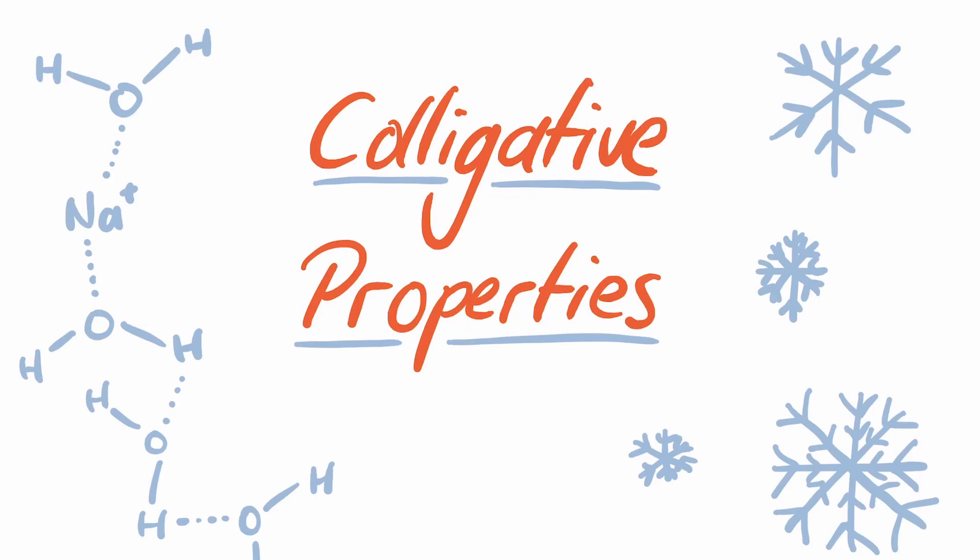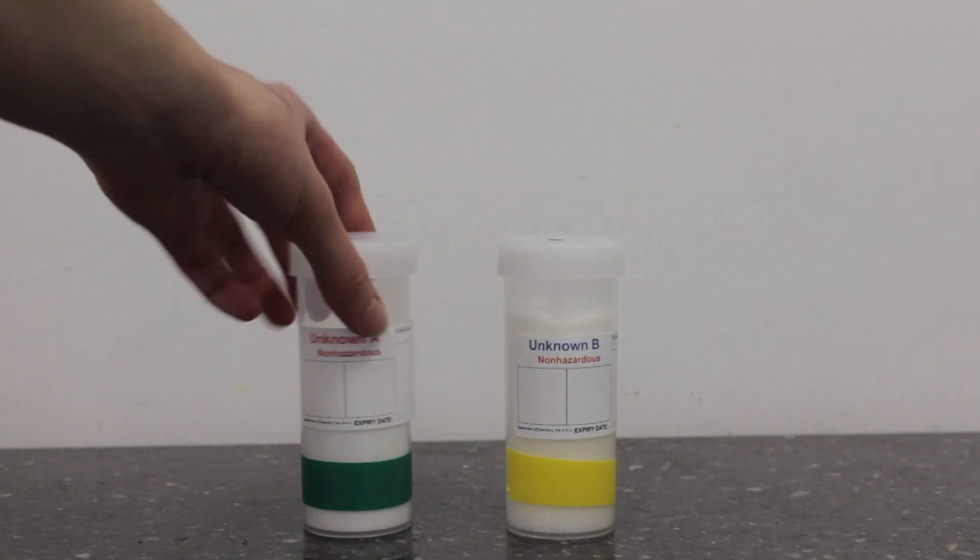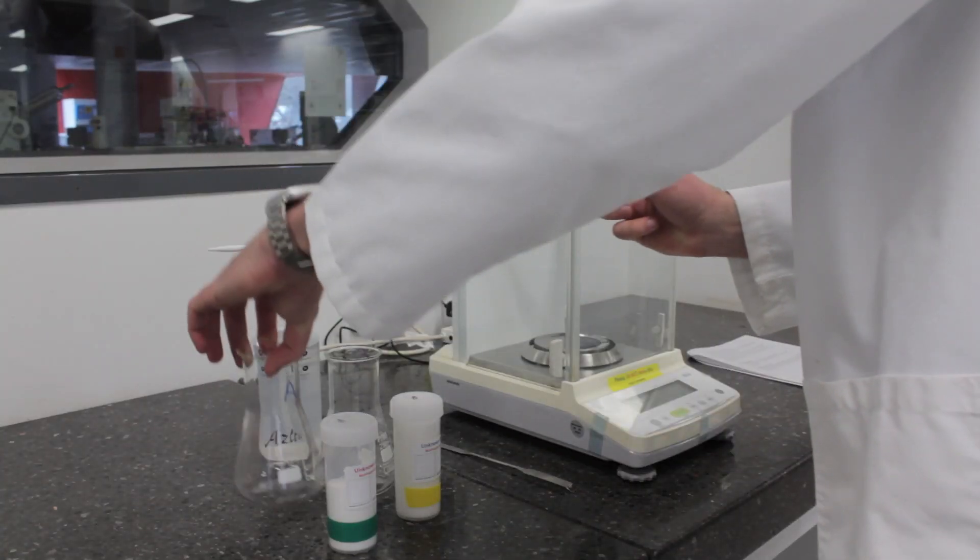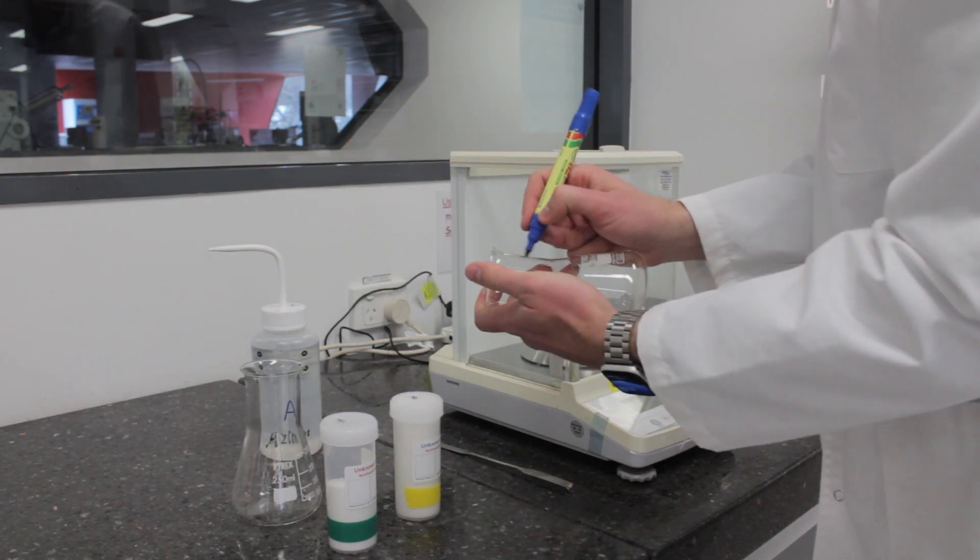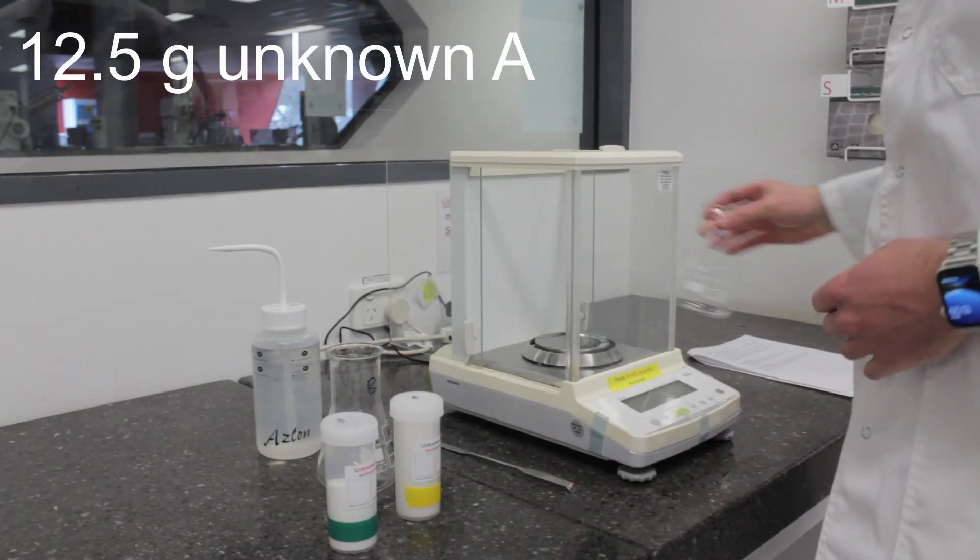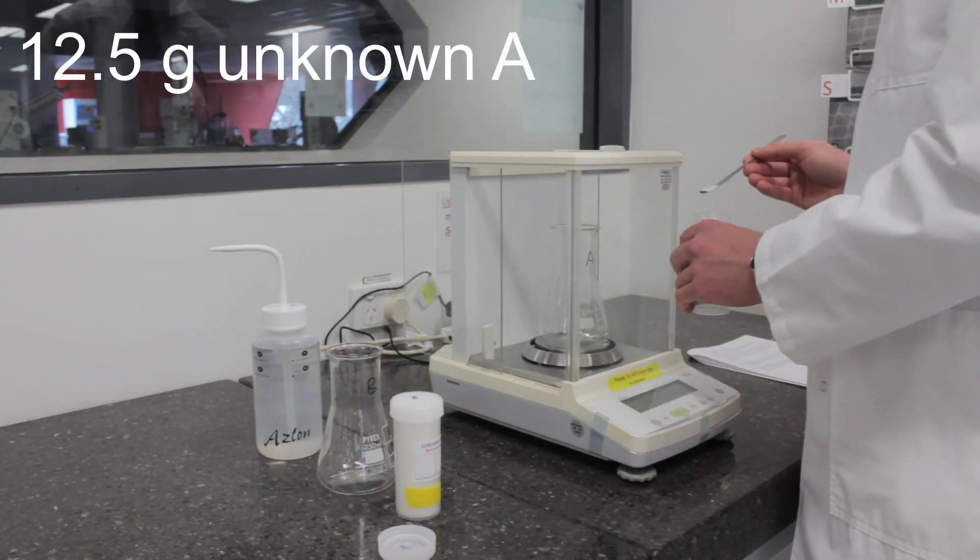These unknowns take a while to dissolve, so let's first make up these solutions. Label two 250 ml conical flasks with A and B and then weigh out 12.5 grams of unknown A into one of the flasks.